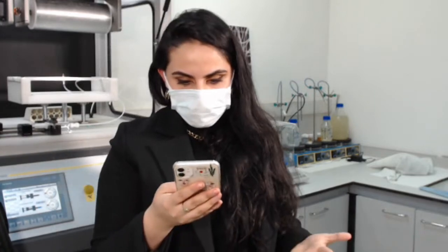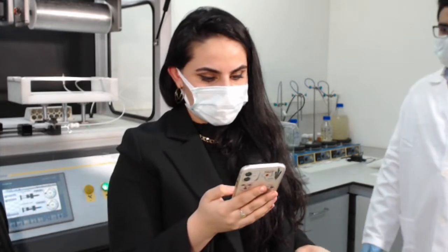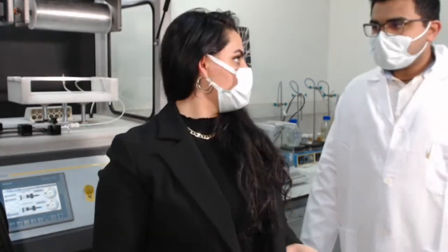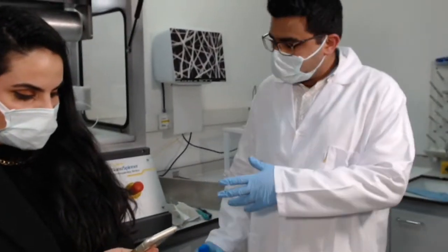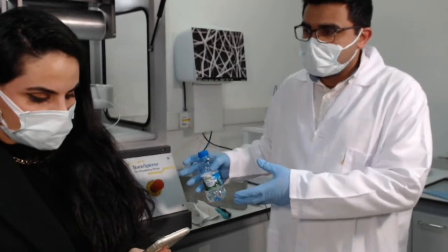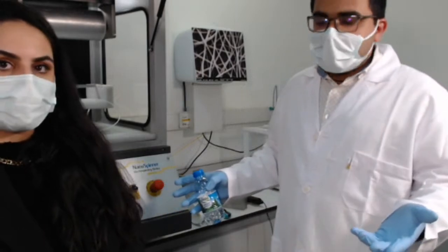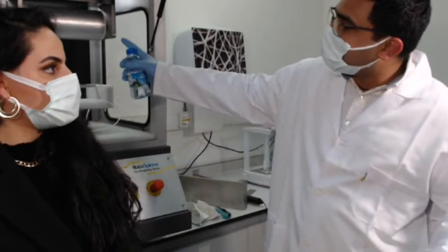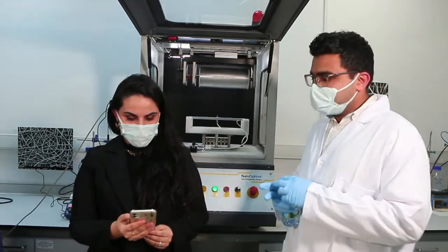Is there any way to recover the solvents in the cabin for PE300? For solvents, once they're used in the system, once they're filled in a jar, consider them already in the solution. As for recovering, if you mean that they're getting evaporated in the chamber, there's no proper way to recover them. But if they're not used, this polymeric solution will still remain to be used for another time.